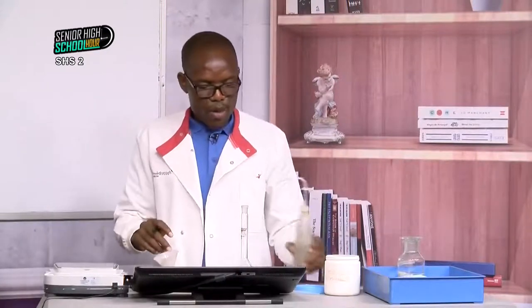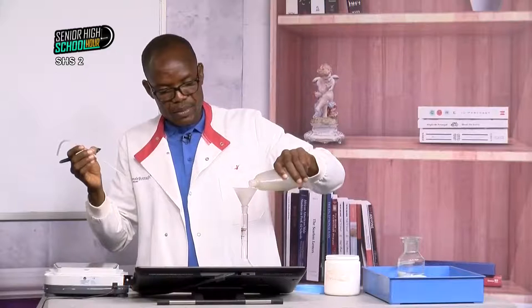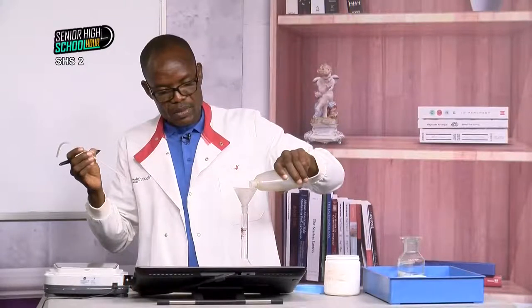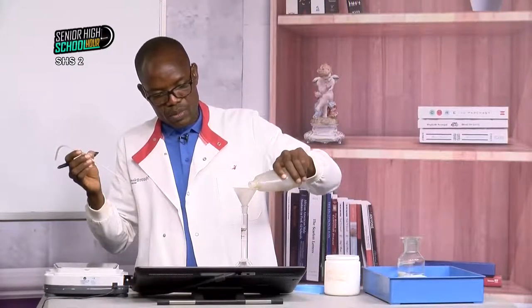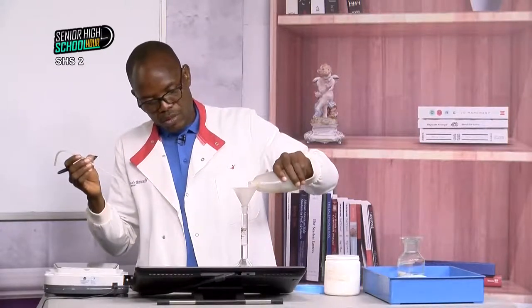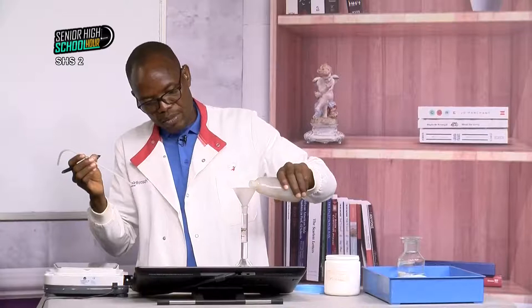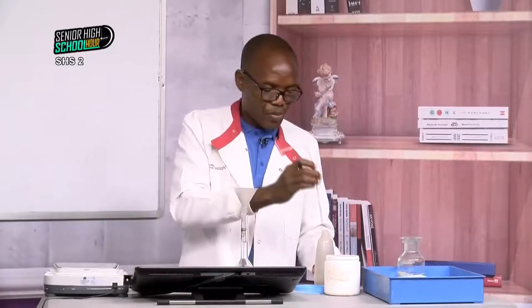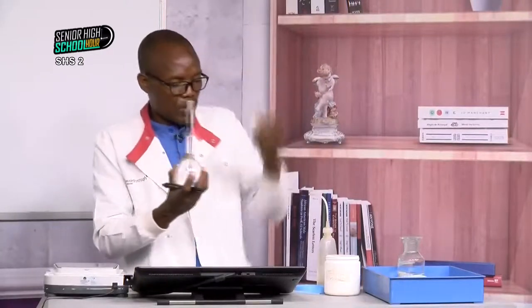Okay, so I top up. The funnel can still be there because I want to be very fast. Take this off, and then you pour the distilled water. Careful. Careful. About 1 cm away from the calibration mark. Okay. So drop your funnel.